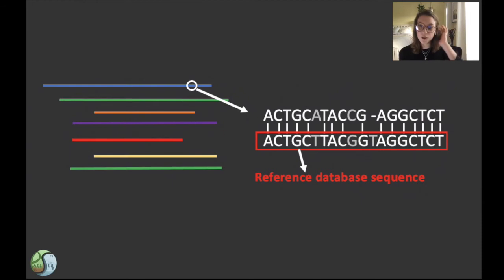By the end of the Tools for Bioinformatics video, we had discussed that our data for PARE-Seq comes from nanopore long-read sequencing, and a FASTA file is the sequence of DNA bases present in your environmental sample. But how exactly does Galaxy sort through this sample to tell us what antibiotic resistance genes are present and which species of bacteria they came from?